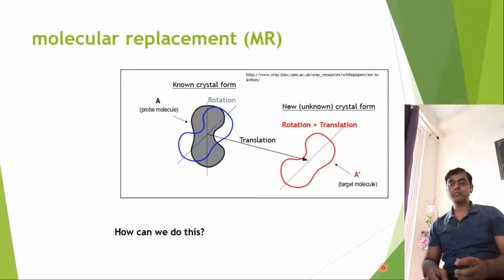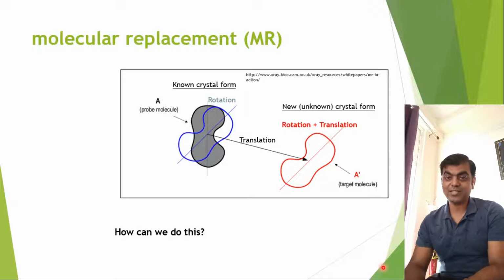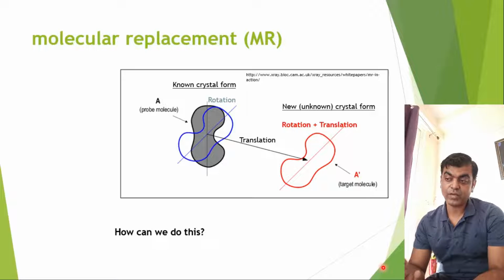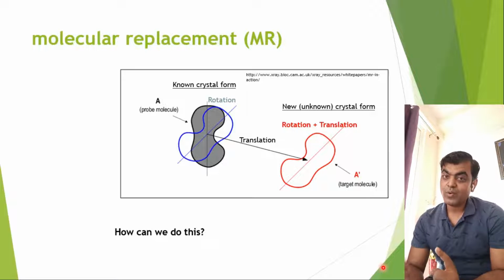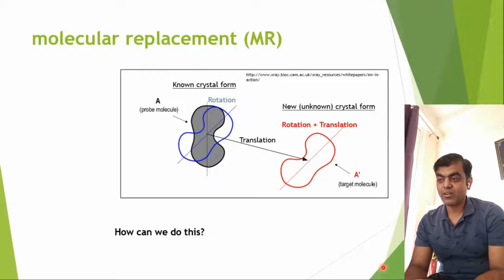Now this is basically a rotation that has happened, and because of this rotation, these two are not matching. So I have to understand if it rotates, if I change the angle of rotation, will these models fit with each other? And then comes, along with the rotation, the translation, you see the shift here. From the position, these two axes were there, and based on these two axes the rotation has happened in this direction, right, at the same position.